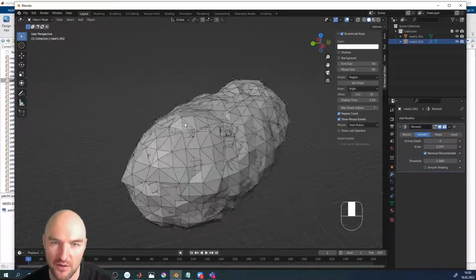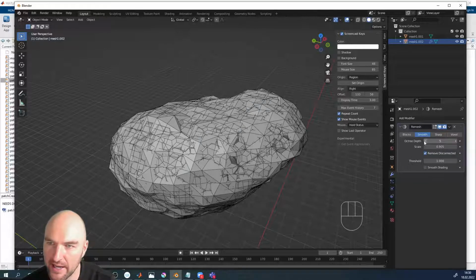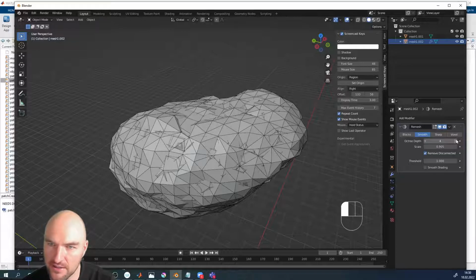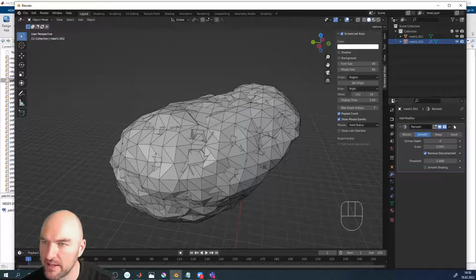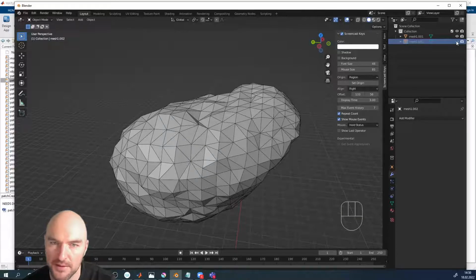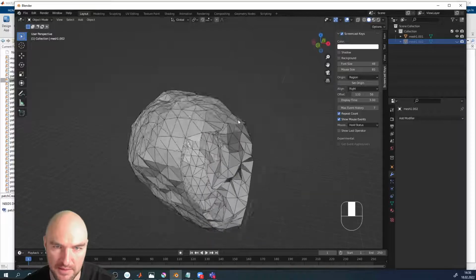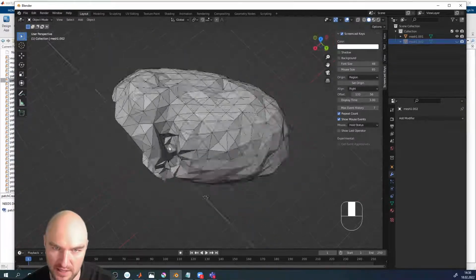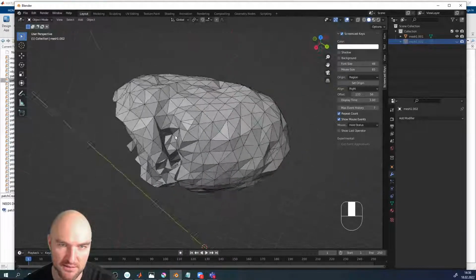And if I compare that with the other mesh, you can see it's a little bit different. It's not quite exactly on the same spot as the other surface, but it's relatively close. This is why we usually avoid that, but we hope that in the next version of Atom Blend we're going to have the explicit possibility to do isosurface in here, and then we can do that while preserving the distance, the distance faithfulness, if you will.